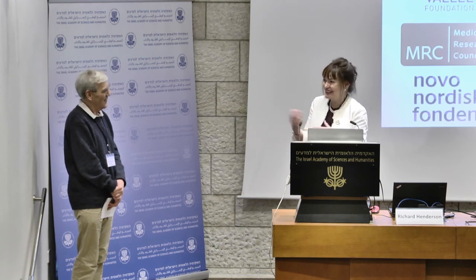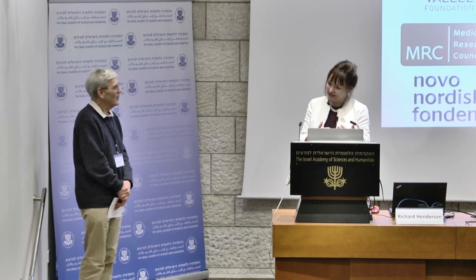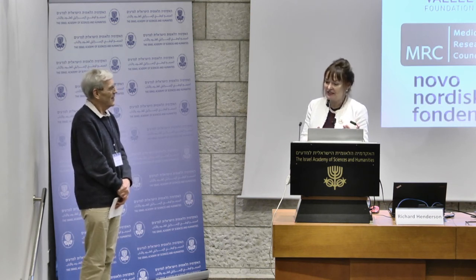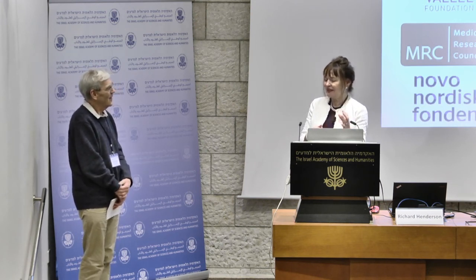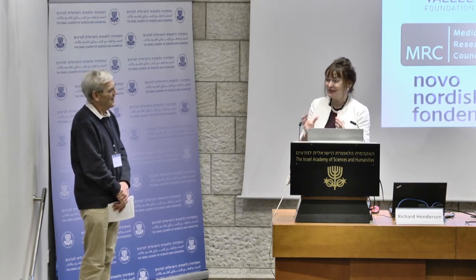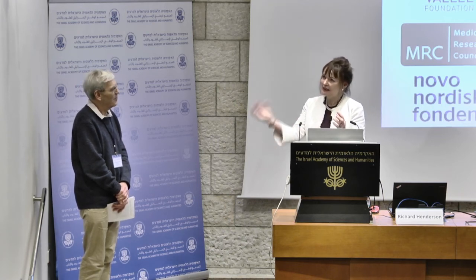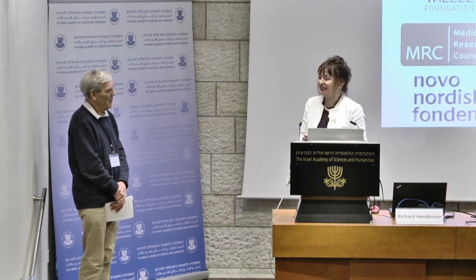Apoferritin looks good, and that again is a robust molecule. So at the moment, that is a very fruitful and active area of research. I personally don't think we'll ever use it to prepare your grids, but I do think we'll be able to look at things, and mass spec playing more intimately with EM is, I think, a very good way forward.